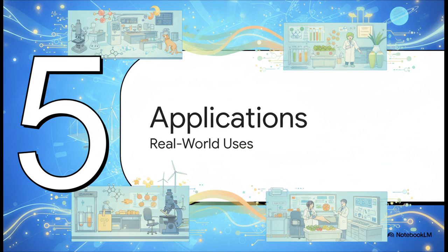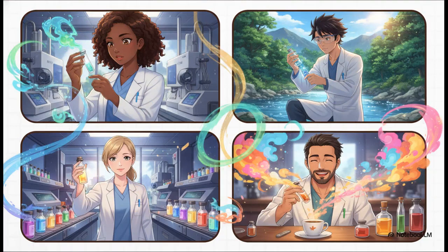And that leads us to our final section, real-world applications. So, why does all this matter? Where is this being used outside of a textbook? Well, because it provides exceptional sensitivity, high selectivity, and reliable analysis while virtually eliminating false positives, GCMS is the undeniable authority in countless fields. In forensic science, it's the absolute standard for detecting drugs of abuse and explosives and complex things like blood or hair.